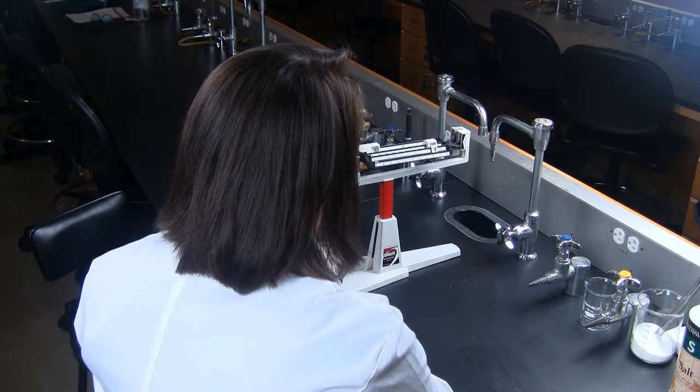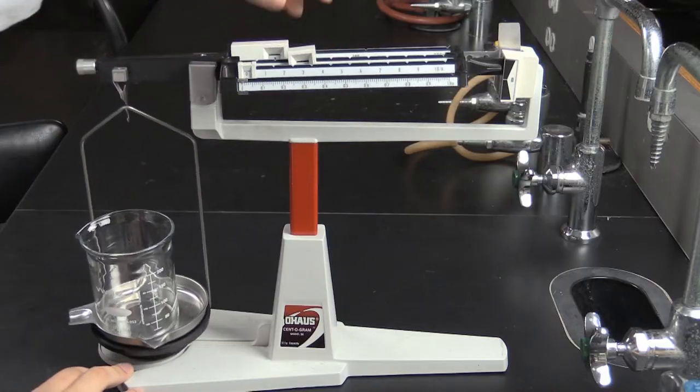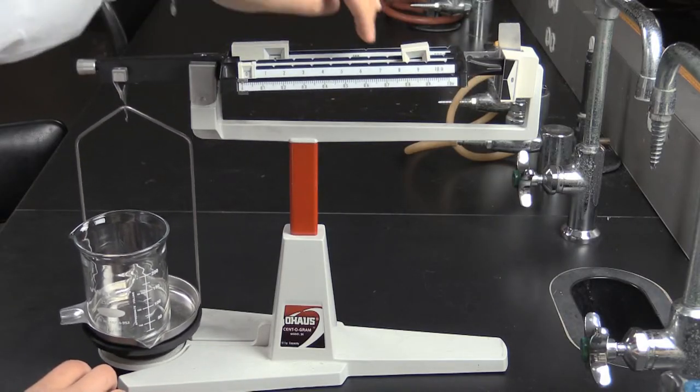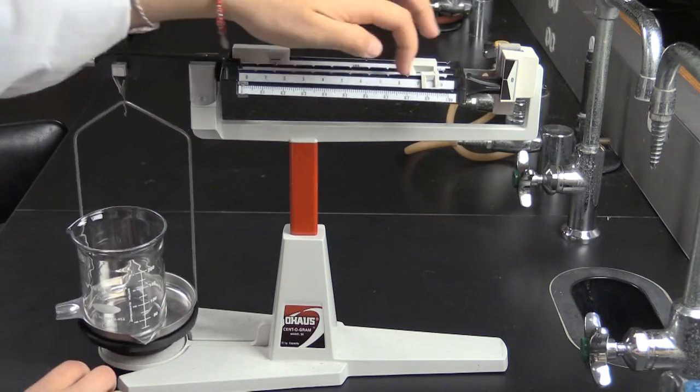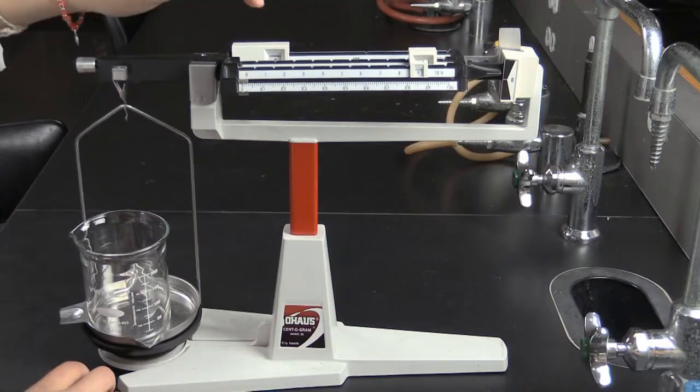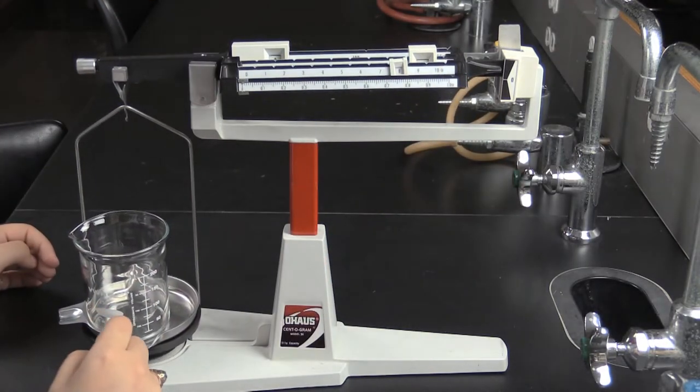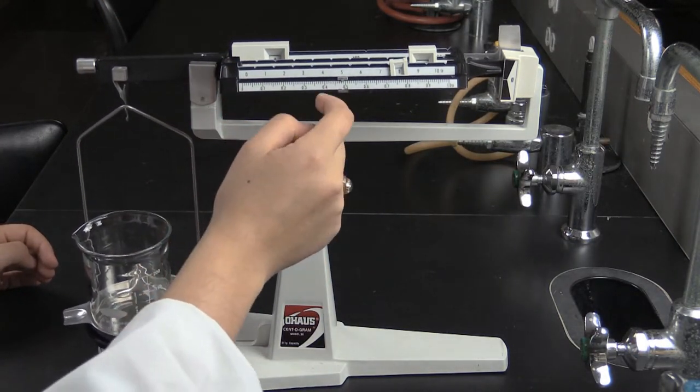Now slide the sliders back and forth until you reestablish balance. Start with the largest place value. In this case, it is the hundreds place. Move the slider until the beam goes out of balance in the opposite direction. Then move it back one slot.